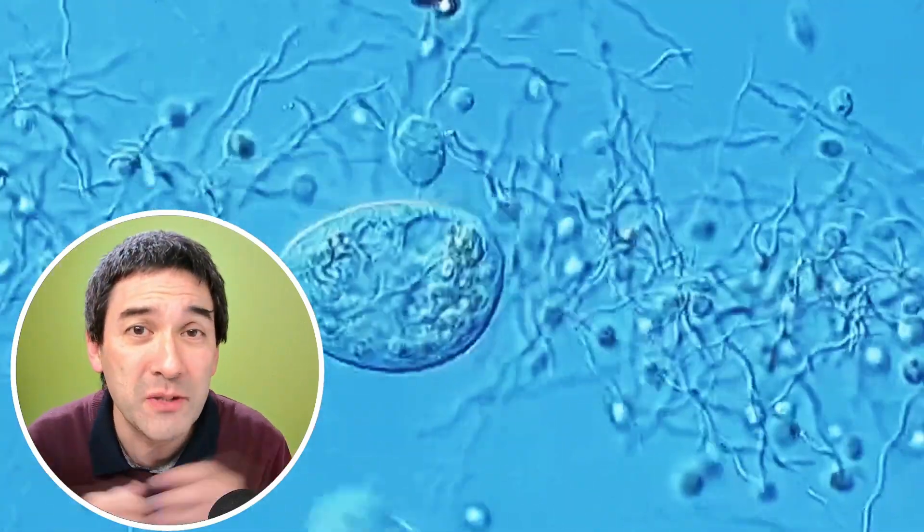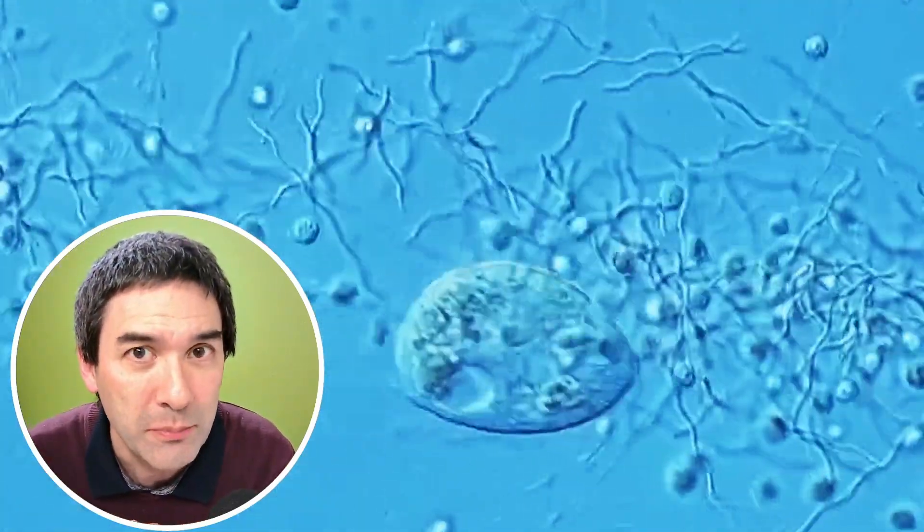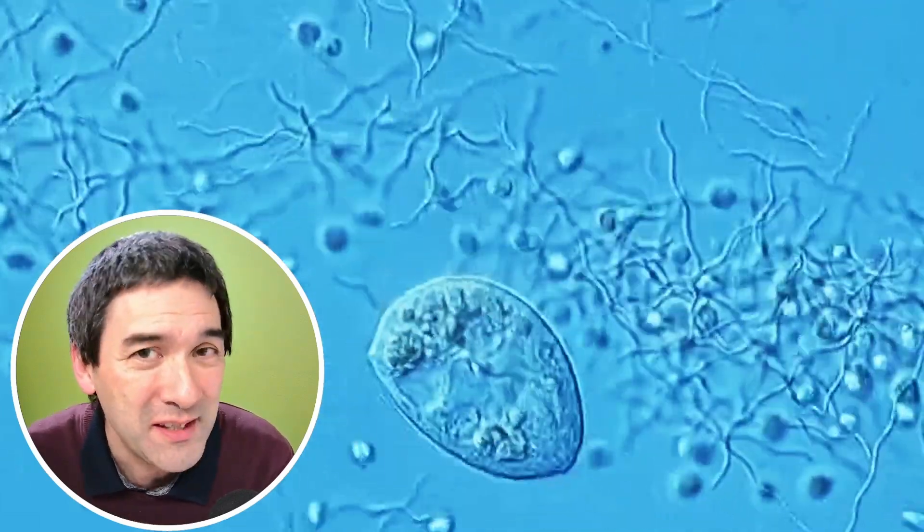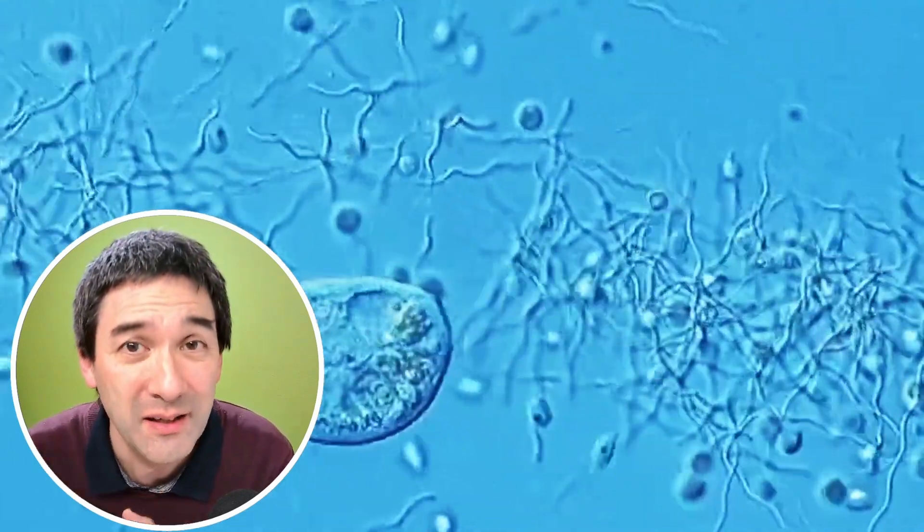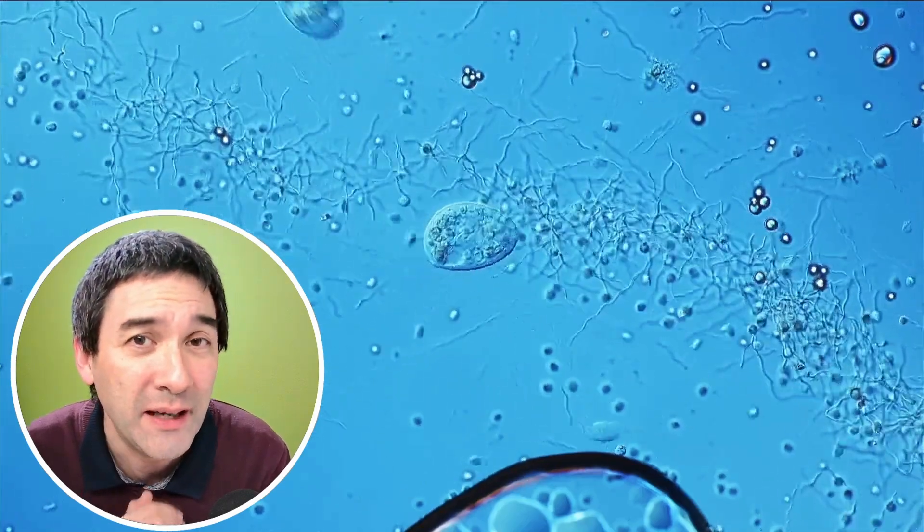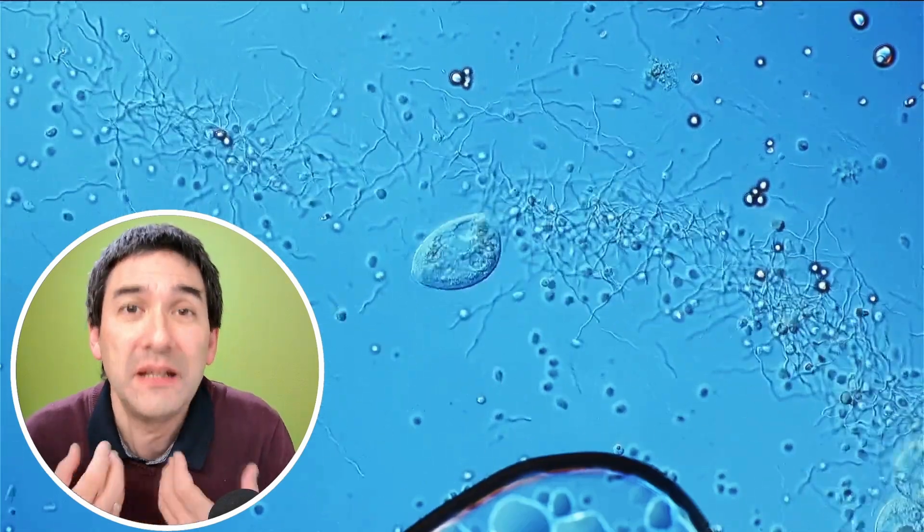you can see that those spiral-shaped spirochetes—spiral-shaped spirochetes, what a tongue twister—that they are almost the same length as those ciliates that you see here. So I have my doubts whether they're actually able to engulf them and eat them up.